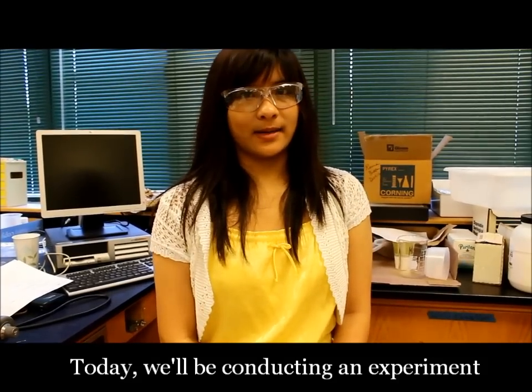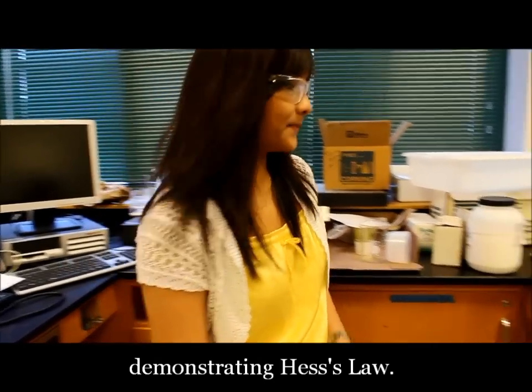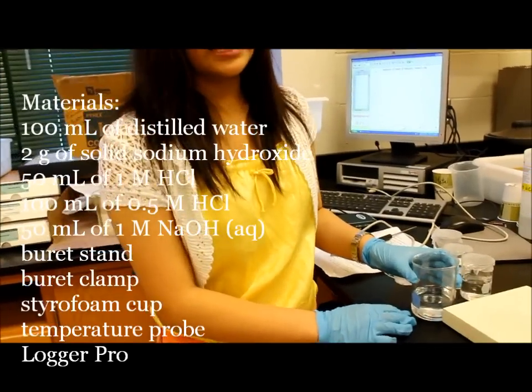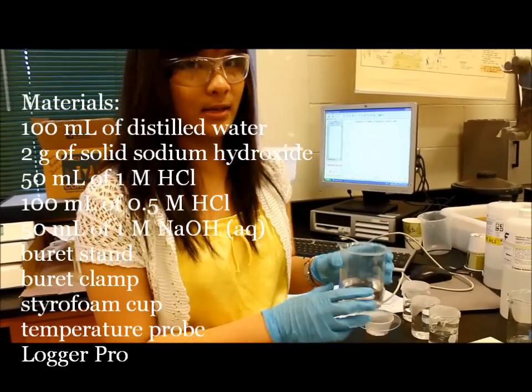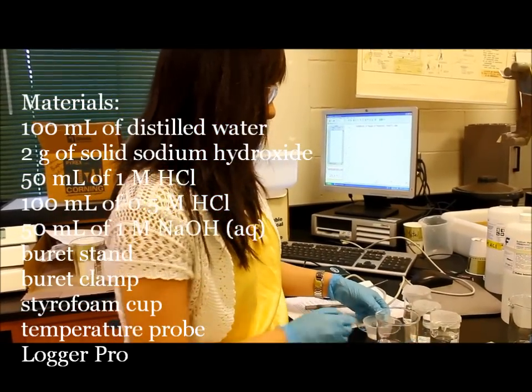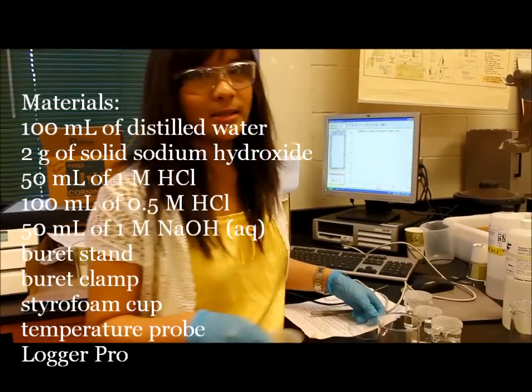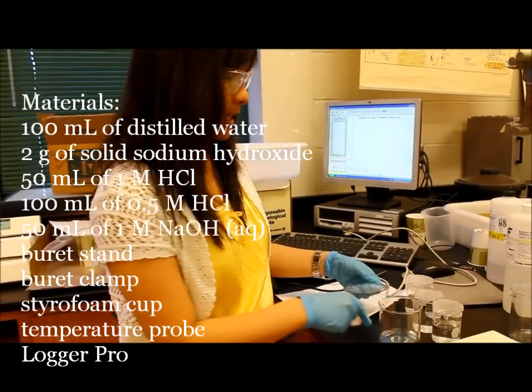Today we'll be conducting an experiment demonstrating Hess's Law. The materials we're going to need include 100 milliliters of distilled water, approximately 2 grams of solid sodium hydroxide.